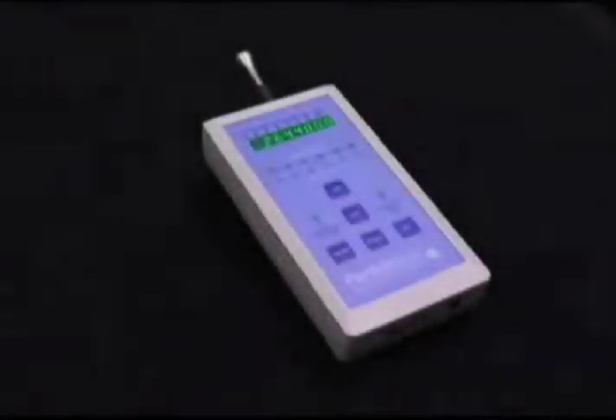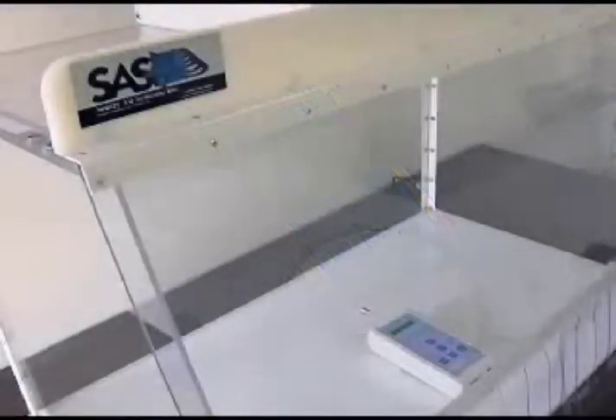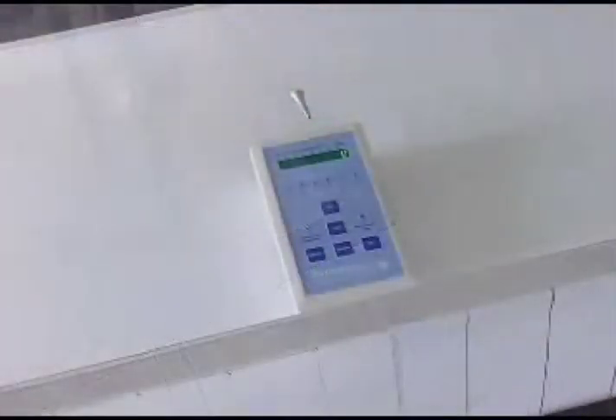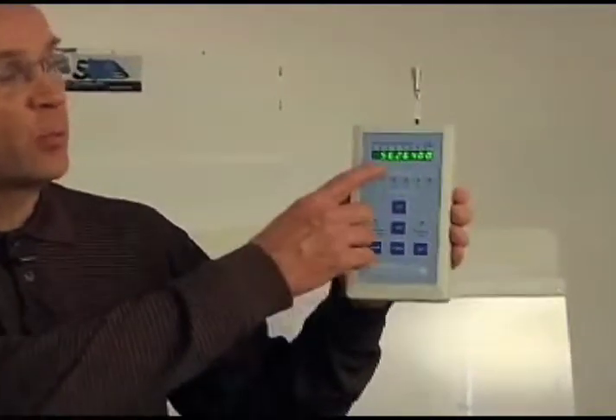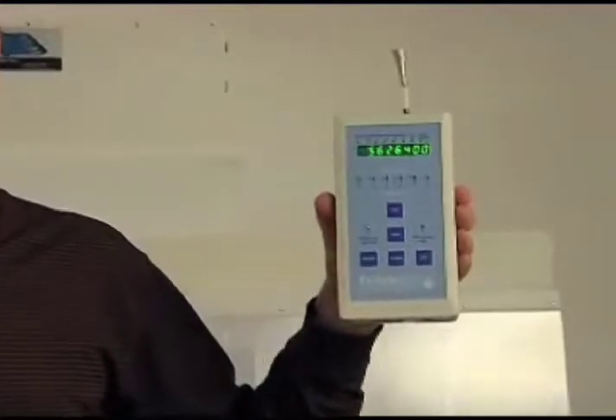To quantify the ambient particulate concentrations for this test, we're using a Particle Scan Pro airborne laser particle counter. Before the test begins, as you can see, the current concentration of particles that are 0.3 microns and larger in this room is approximately 5.6 million particles per cubic foot.